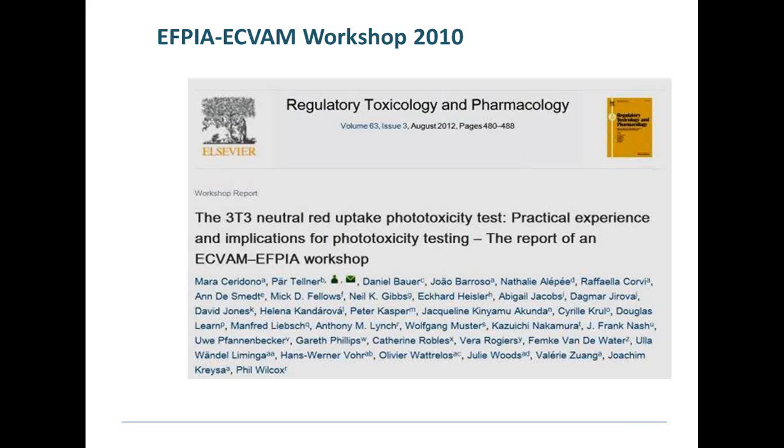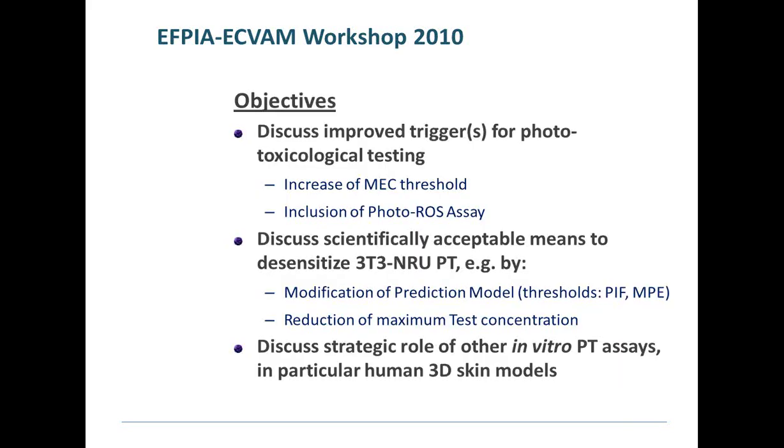This is just the cover and title of our workshop report, which was published in Regulatory Toxicology and Pharmacology, where FPA, organized by ECVAM, met in Italy with all the experts involved in the validation study and in the acceptance process.